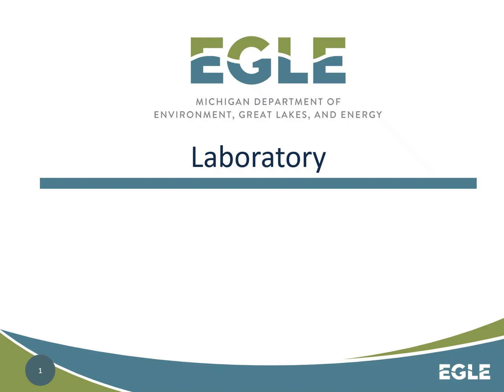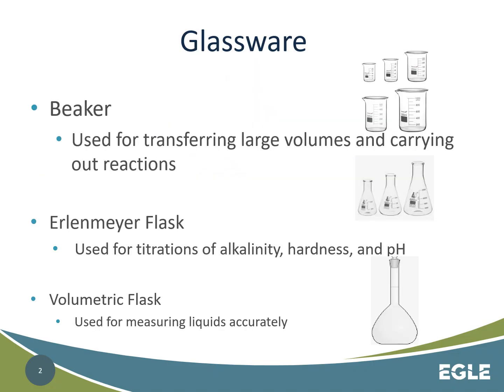Hi, and welcome to the session for the Complete Treatment Entry-Level course about laboratory. In this presentation, we plan to explore some of the safety procedures, some of the lab techniques that are used commonly on a daily basis, weekly basis, and even talk about some that are not so common, all right? So we're going to start with talking about glassware.